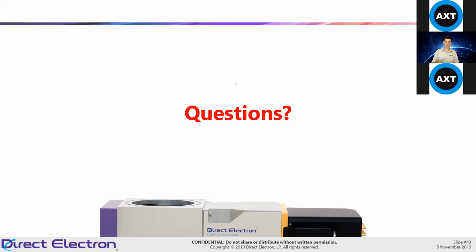Typically what we do is that at the moment we don't have any compatibility with the Gatan energy filters. There is one example of a Gatan GIF that has a DE camera on it, but that's sort of a special case. But most of the time, you'd find the DE cameras in the same location as the Falcon or in the pre-GIF box. Typically, because our pixels are smaller than the Gatan products, if there's not a GIF and you have, say, a CETA camera or a Falcon, we like those to be on the bottom or below our cameras because the smaller pixels deal better with less post magnification.